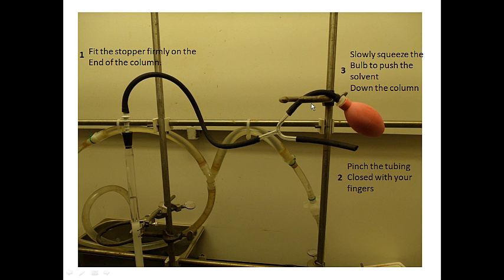Now remember, you get the best separation with a slow column movement or slow mobile phase movement, so the faster you push, the worse your results will be, but if you wait forever, you will get no results. So we have to find a happy medium in between.